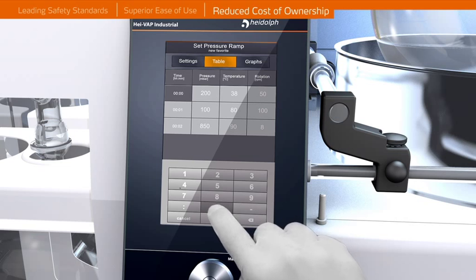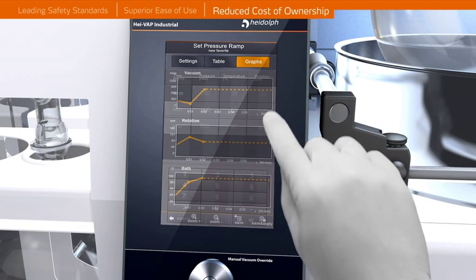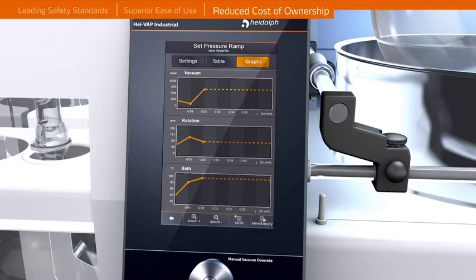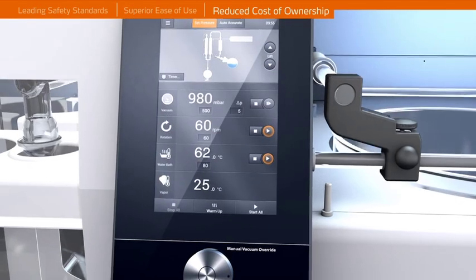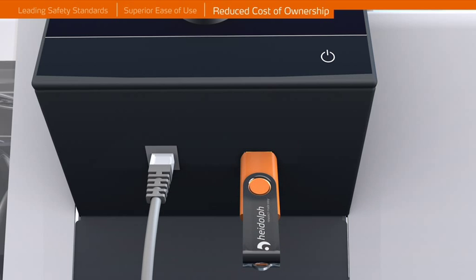Productivity increases can be achieved by utilizing some of the integrated automatic distillation programs and ramping functions. Instant software updates and process documentations are enabled through USB and LAN interfaces.